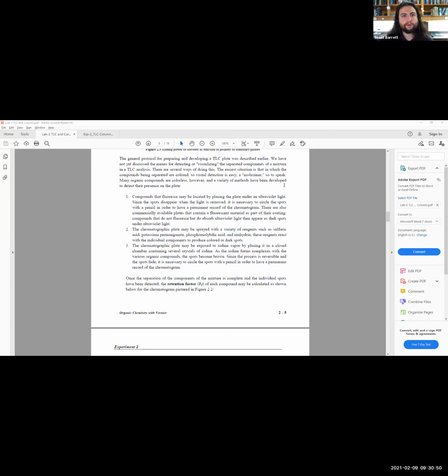So moving forward, we will see that some compounds may fluoresce. So we actually utilize a UV lamp. You've probably seen them in a lab. I can't really recall if it was in Gen Chem lab, but effectively you would use a little UV lamp. It's the same thing as a flashlight, except you would be utilizing a UV filter or UV luminescent light bulb that would shoot UV rays onto your TLC plate, and it would illuminate the spot that is fluorescent under UV light.